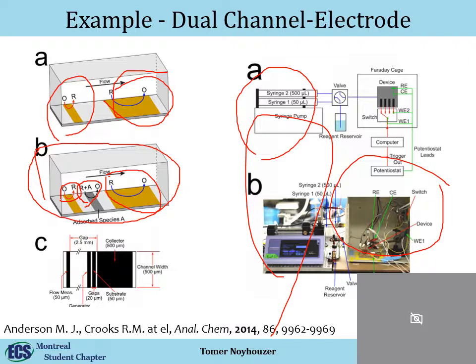Because at the end of the day, if you want to make something that will be sold, the user would want something very, very simple. Just pushing a button or getting a result, they don't want to see all these wires. They don't care if the system works perfectly. If the system doesn't look nice, they won't touch it. But when you're in the experimental stage, this is fine.